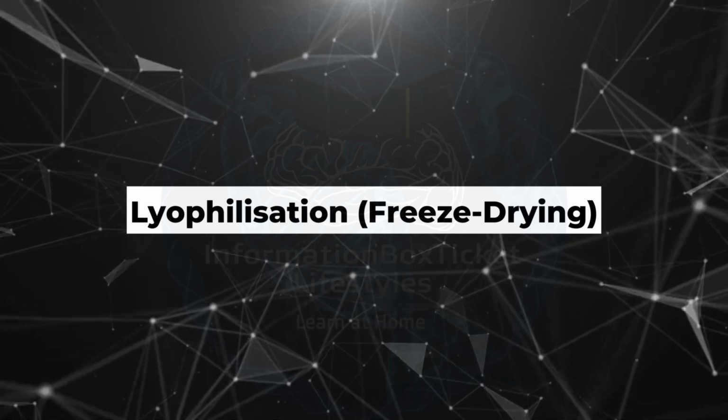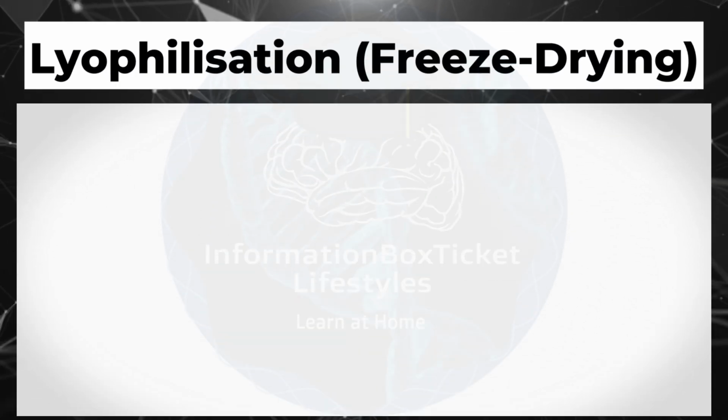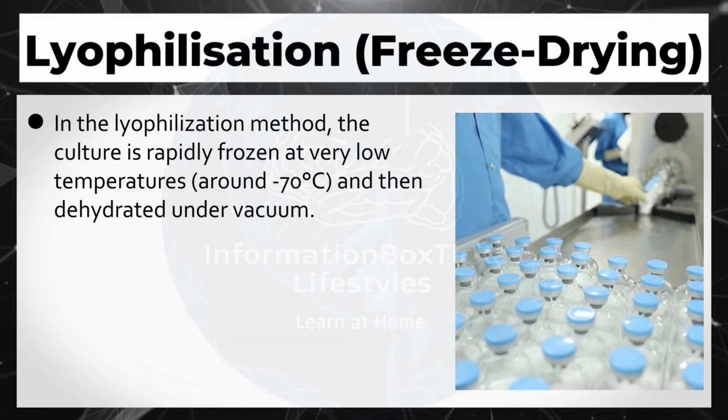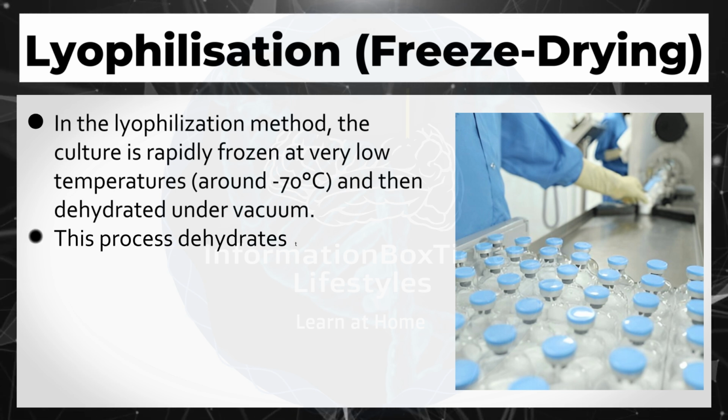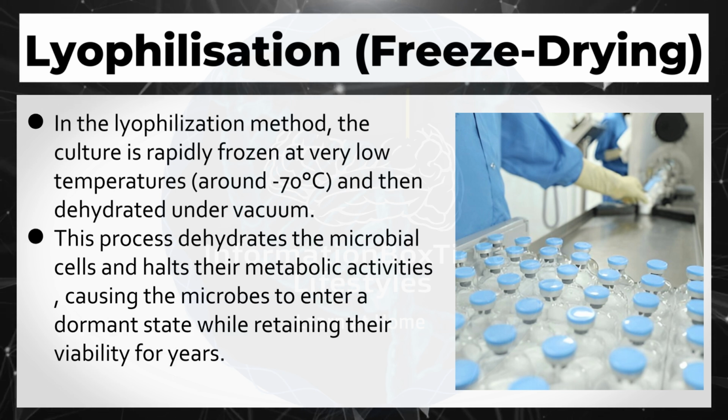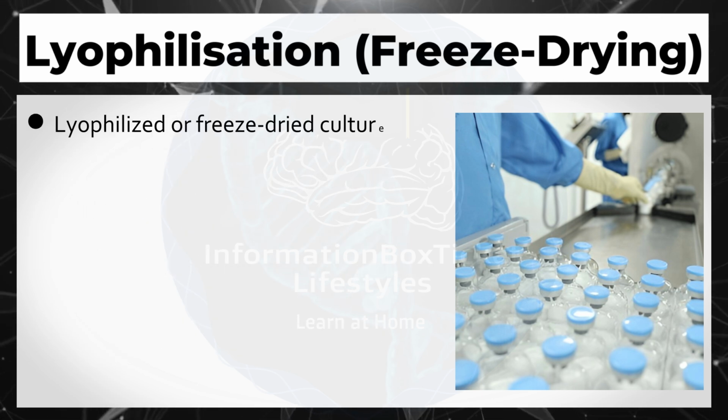Lyophilisation, freeze drying. In the lyophilization method, the culture is rapidly frozen at very low temperatures, around -70 degrees Celsius, and then dehydrated under vacuum. This process dehydrates the microbial cells and halts their metabolic activities, causing the microbes to enter a dormant state while retaining their viability for years.